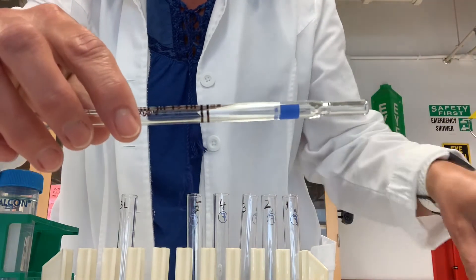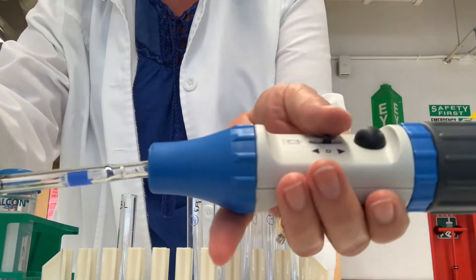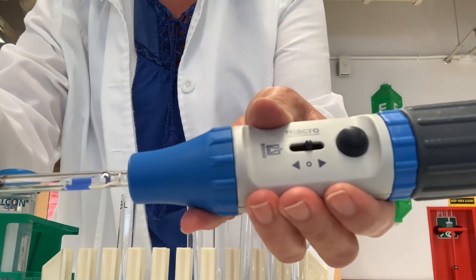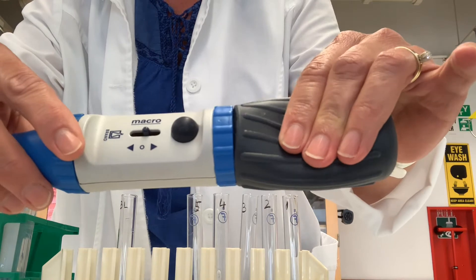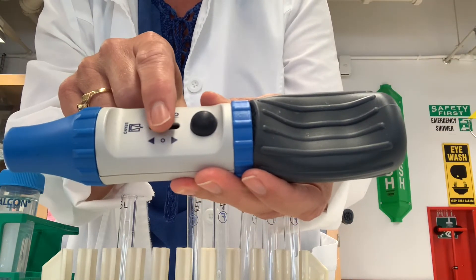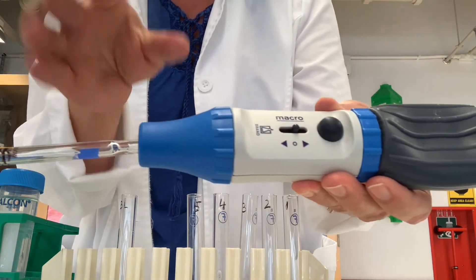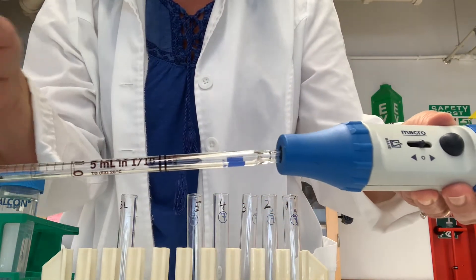To use a pipette, you insert the top into a pipette filler. You depress the bulb to expel the air, and then pressing the button up draws liquid into the pipette, while pressing the button down expels the liquid out of the pipette.